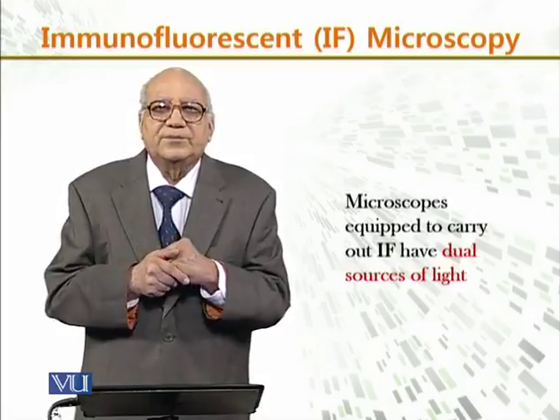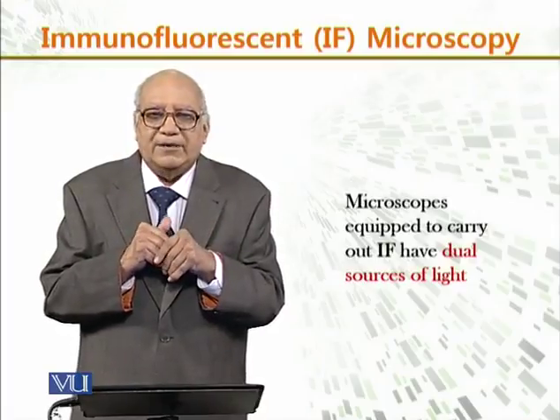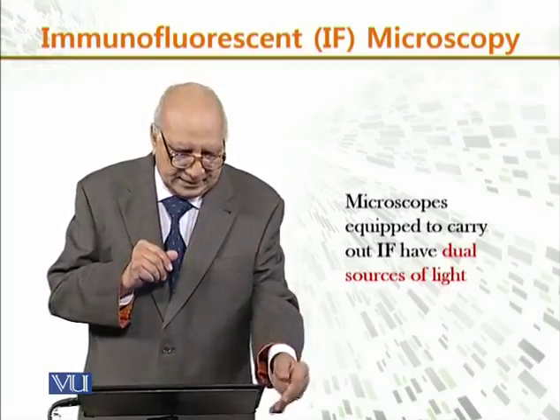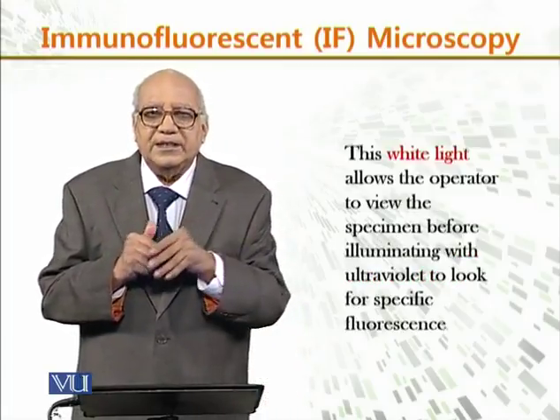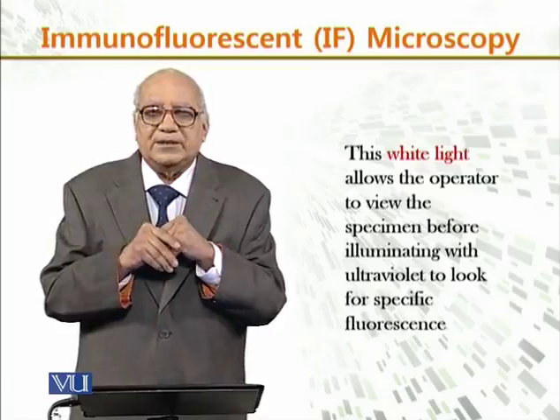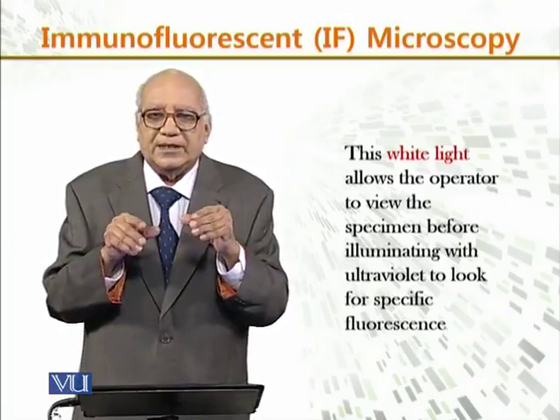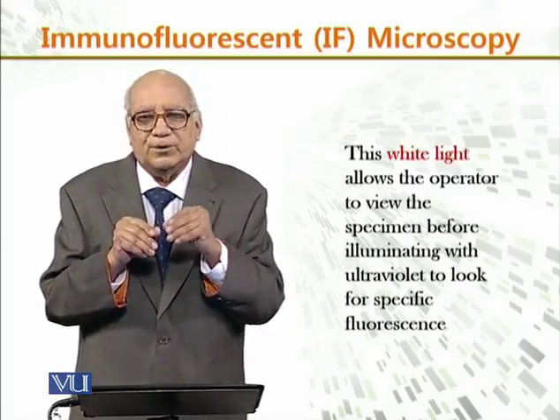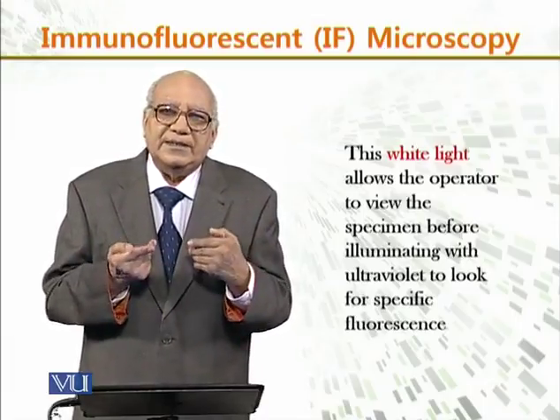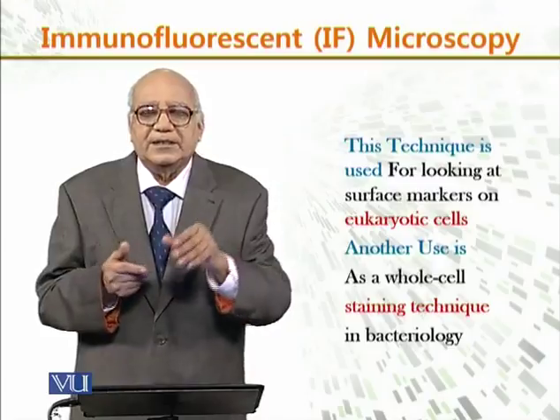Now, microscopes which are equipped to carry out IF have dual sources of light. This white light allows the operator to view the specimen before illuminating with ultraviolet to look for specific fluorescence, that is, whether it is red or green. So first, the white light is used.